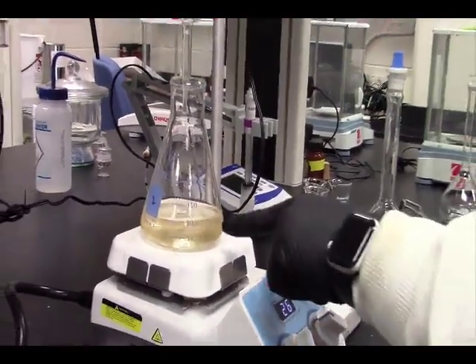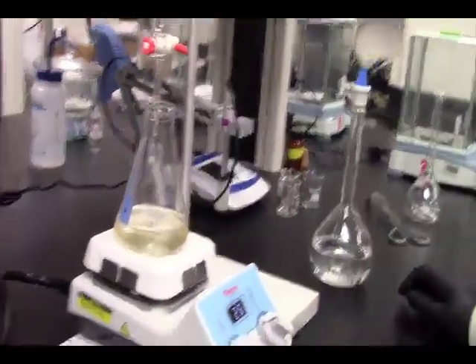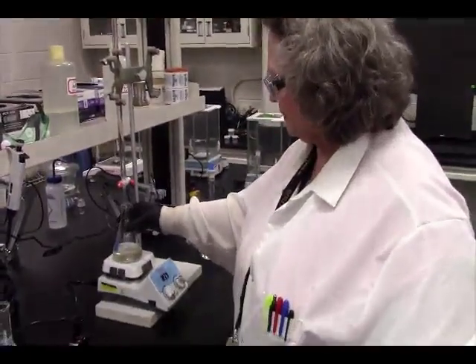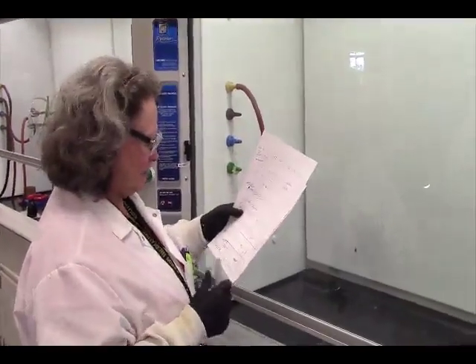But see how this one remains slightly yellowed? You can tell our blue is gone, but it remains slightly yellowed. So this endpoint is a little bit more difficult to determine. Okay. Give us a few minutes and then we'll be back at our board to go through some of the calculations. All right, welcome back for calculations.